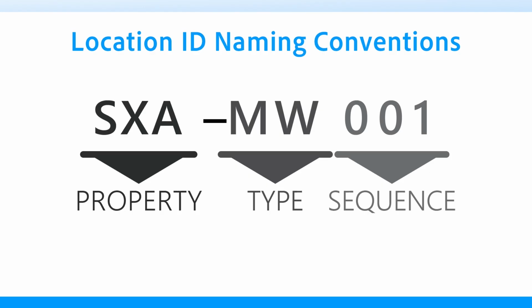Note that the location ID is not the same as the field sample ID. The location is the geographic coordinates where samples are collected. The samples taken at that location will each be assigned their own field sample ID. Depth and sampling date are not part of location ID.